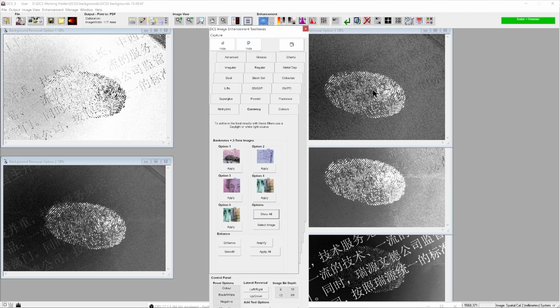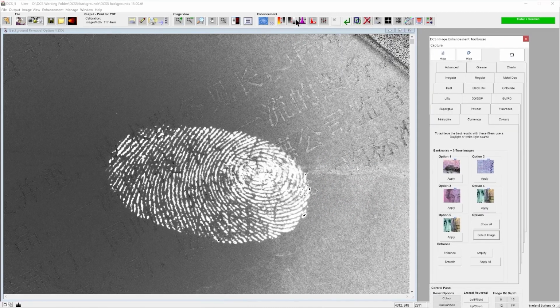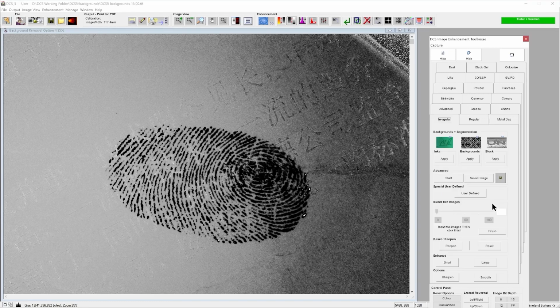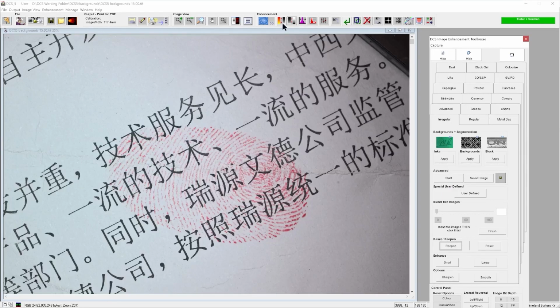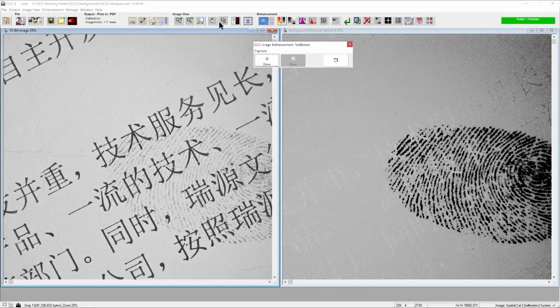Sometimes it will partially disappear, sometimes it will completely disappear, depending on the colours and depending on the lighting. I've very specifically used daylight illumination here. I've adjusted the white balance to make sure the colour is correct. So we can now select either this image, whichever we choose. Let's select this image here. If we simply invert this to give us our black ridges, we're then going to reopen our original image, which we can convert into grayscale.